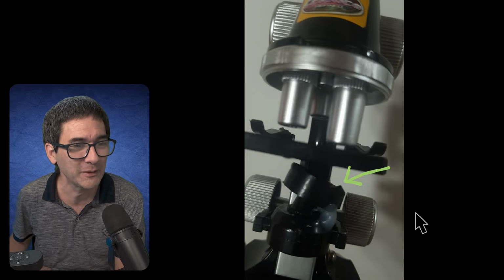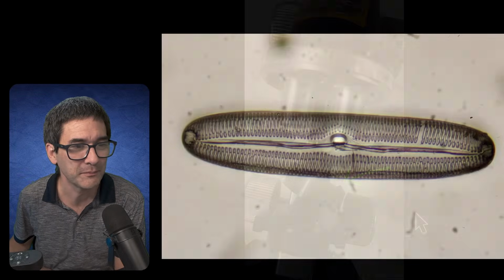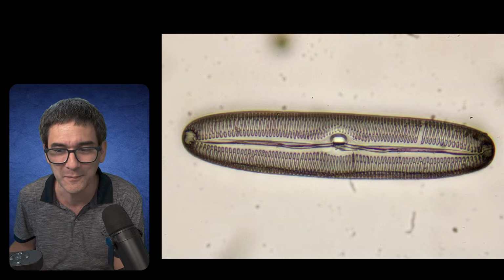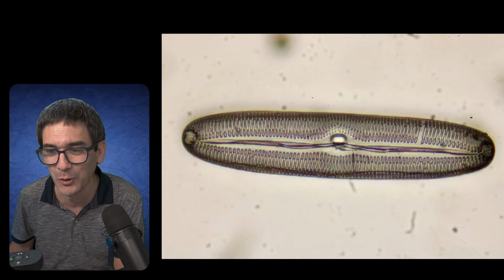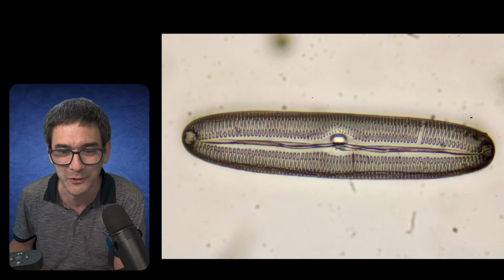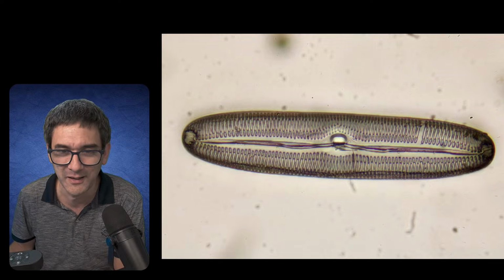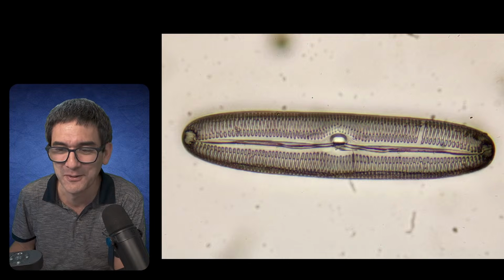I would like to show you something else as well. I think Mike just sent me this before the start of the live stream. Isn't this also a beautiful diatom here? If you've joined the live stream, maybe you can also write in the comments a little bit. Thank you very much as well. Just a couple of minutes before I started the live stream, I downloaded those pictures and I also got the permission to share them.